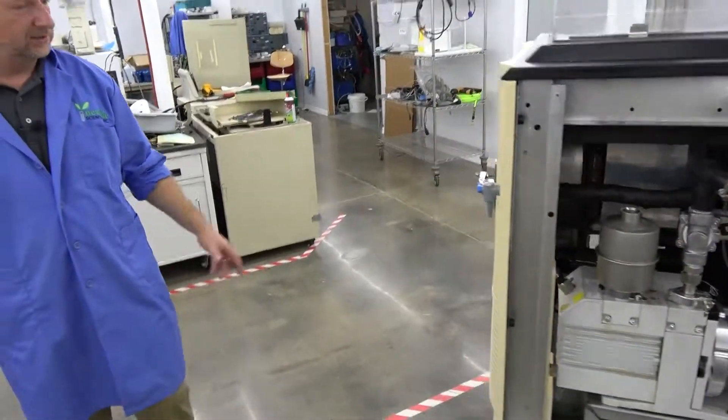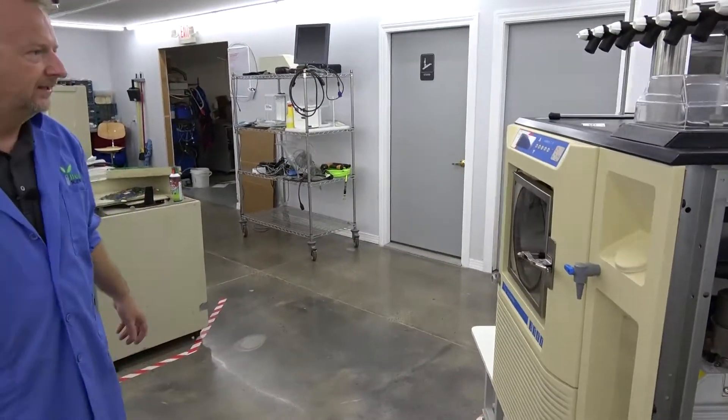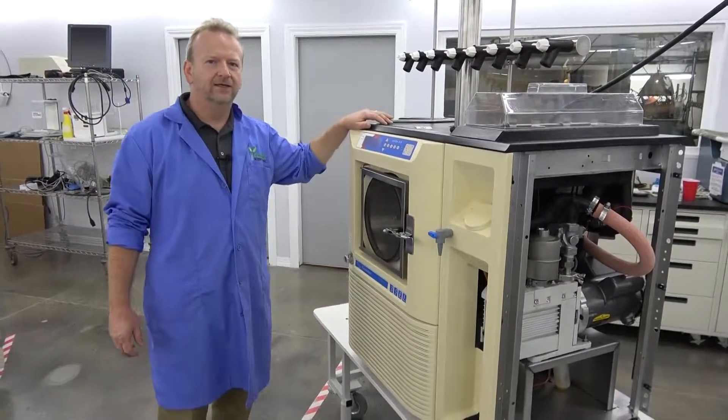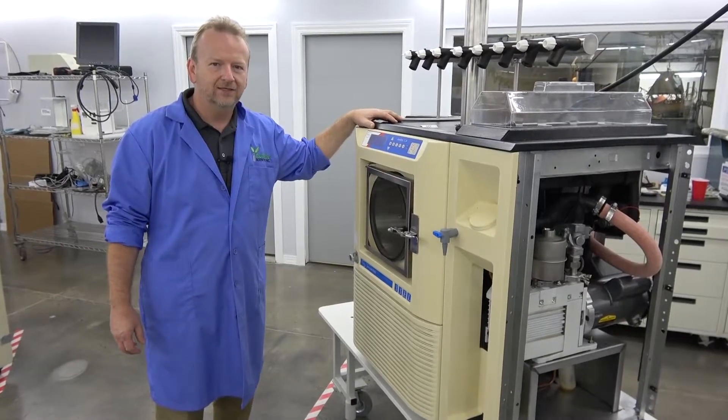But a really good unit, really nice performing, good-looking piece of equipment. It's ready for your lab or your shop. Again, I'm Rich with New Life Scientific, and we'll see you on the next machine.